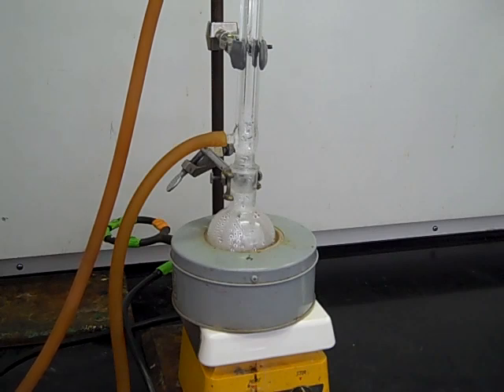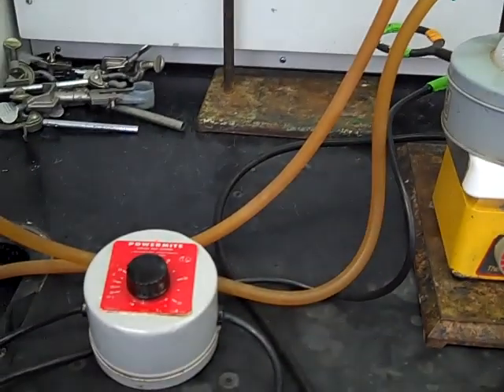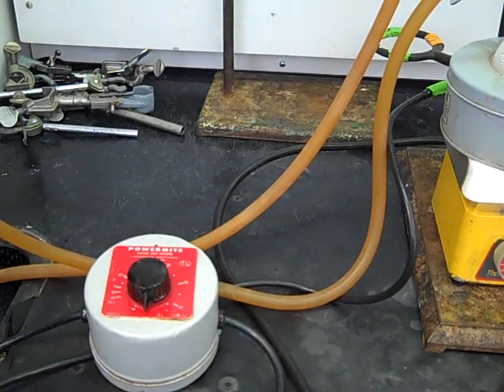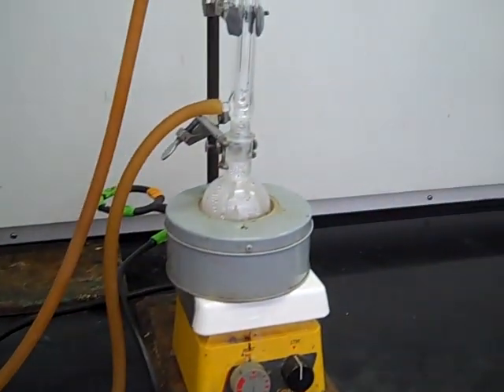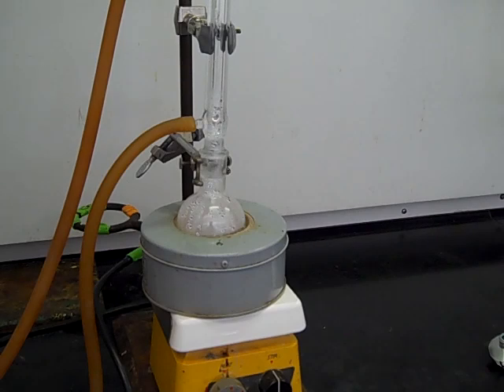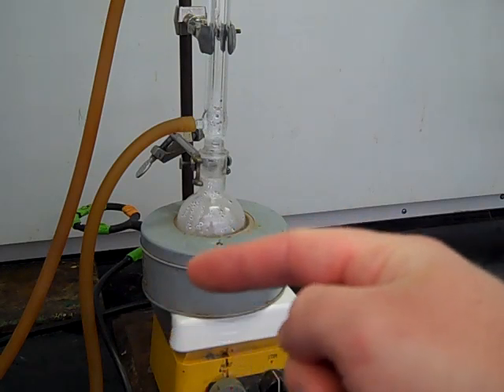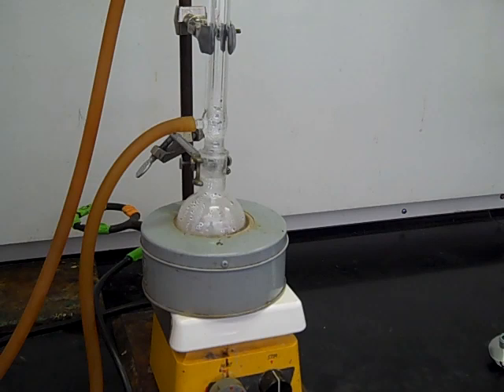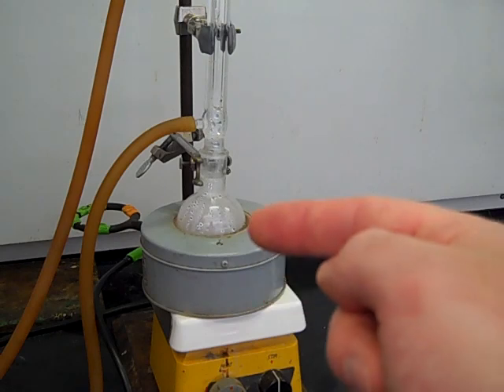Once your reaction is completely done and you've determined that your product has been formed and there's no longer any reason to continue refluxing, first turn off the power mite so that heat stops going to your reaction. The glassware is still going to be hot, so after turning off the power mite, let it sit for at least a few minutes to cool down. Make sure not to turn the water off yet, because even though you turned the heat off, vapors are still coming up and you want those to condense back down into the reaction flask. Once everything has cooled down, you can start disassembling and take your product to the next step.